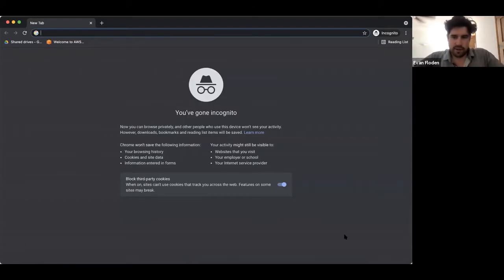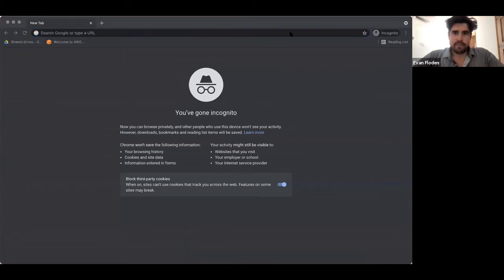And the first thing we're going to do is go to that address. There's a web address in what I just posted to you. And that is a location in AWS, which is going to allow us to log in to our environment. So I'm just going to find that from here. So I'm going to paste that into here.